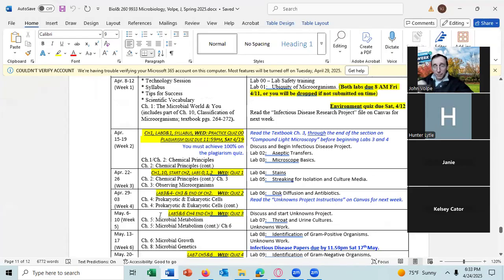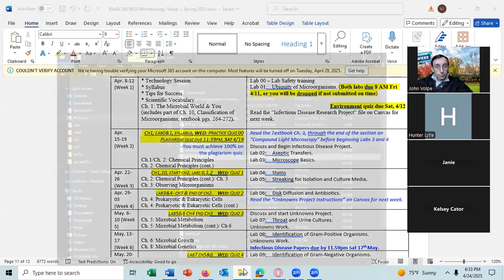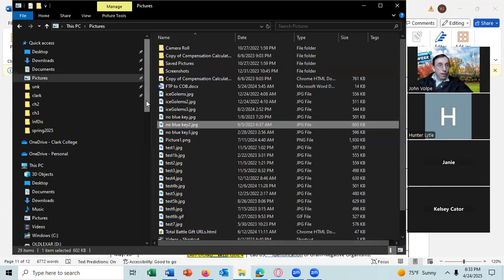All right, today is April 24th, and we're covering Lab 5, Streaking for Isolation and Culture Media. Any question about anything?